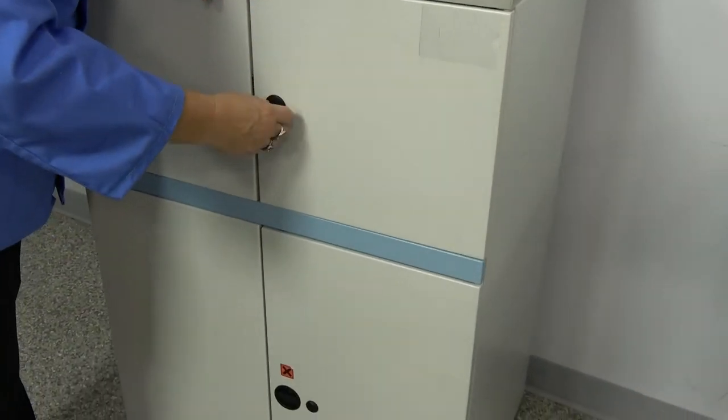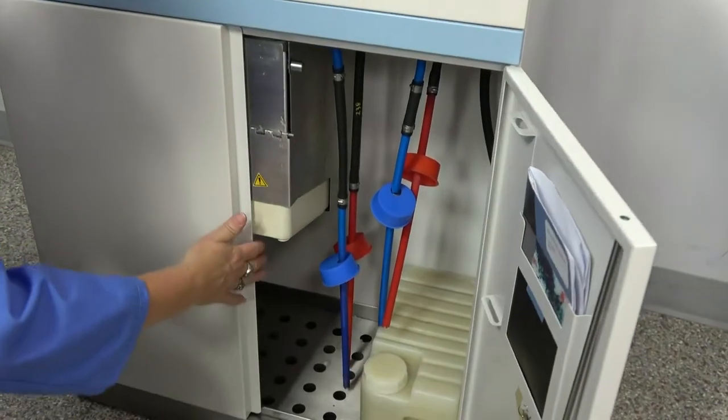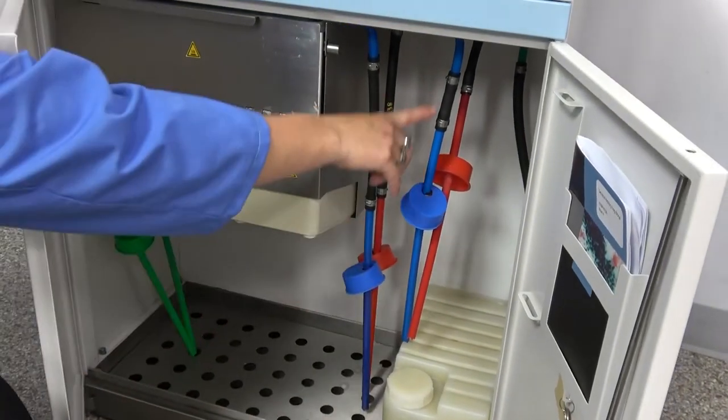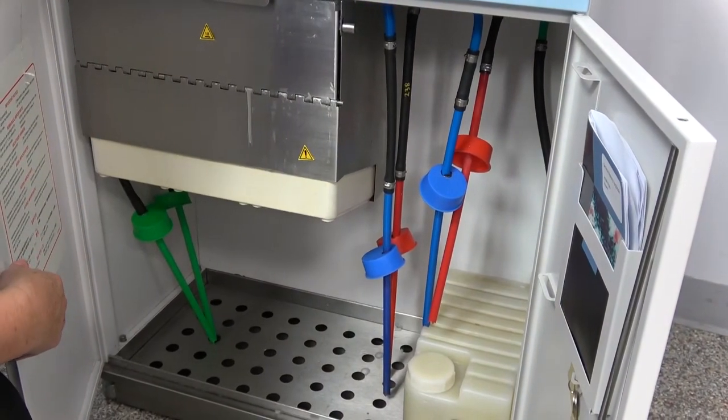Also underneath is room to store bulk reagents. These of course are the tubes where those are fed into the mixing chambers on the back side of the unit.